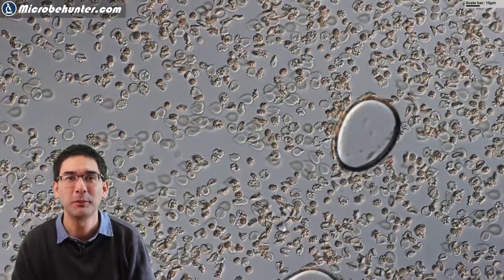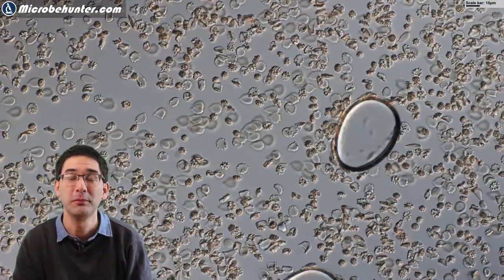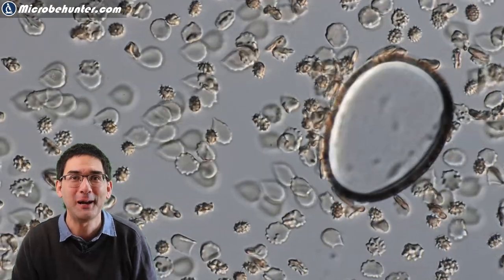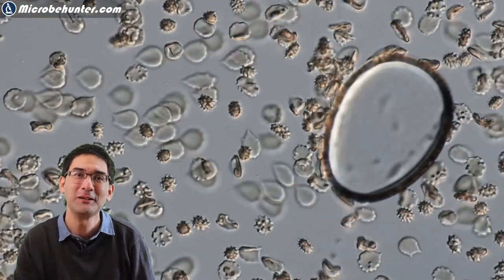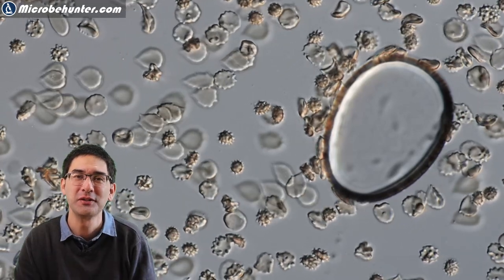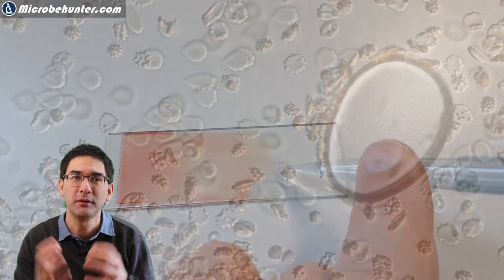Here again, a couple of air bubbles and interesting to see how the blood cells move around those air bubbles, which are essentially like obstructions. It's a little bit of fluid dynamics that you can observe here as well. You can see that some of the red blood cells start to stick around to this air bubble. Quite interesting to see the phenomenon magnified.